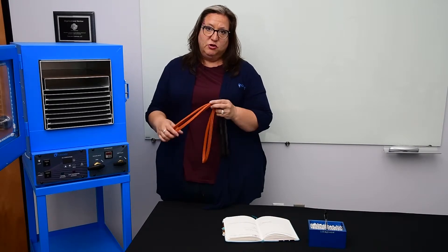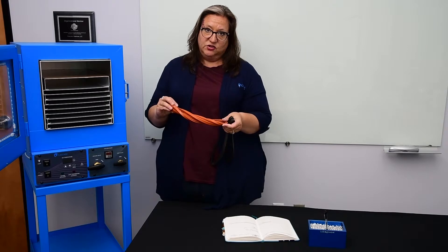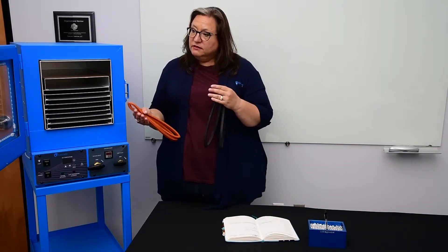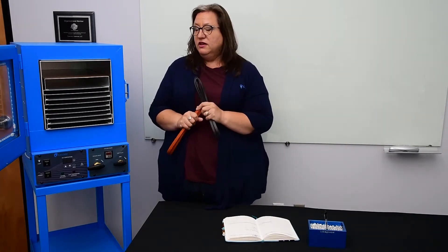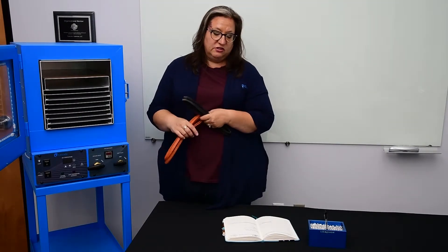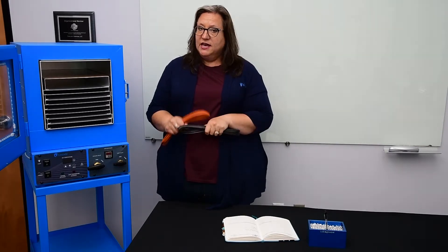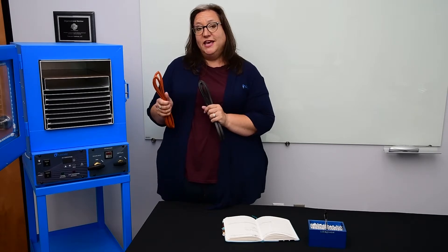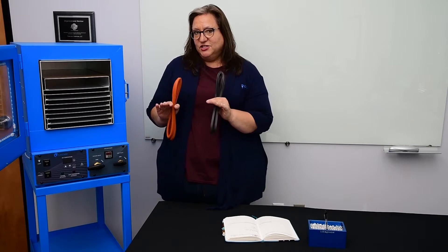The silicone gasket is highly susceptible to solvents. Anything like butane, propane, or ethanol is absolutely going to eat through this gasket and degrade it. So it's a bit of a balancing act to choose which gasket is best for your oven. For our low-temp versions going into botanical extraction applications we always send standard with Buna. On our high-temp ovens we have silicone, and if you have a high-temp and potentially a solvent situation we have Viton, but that has limitations as well.